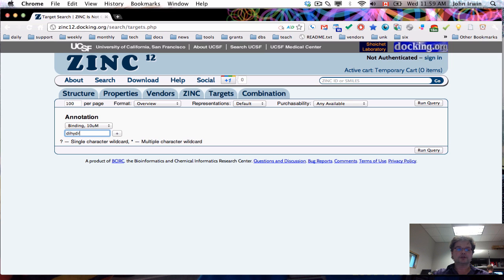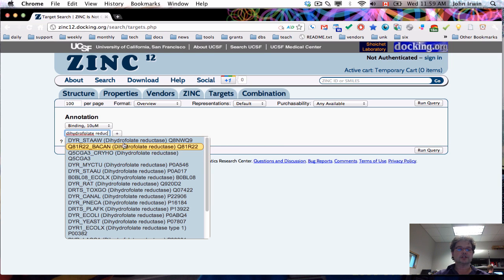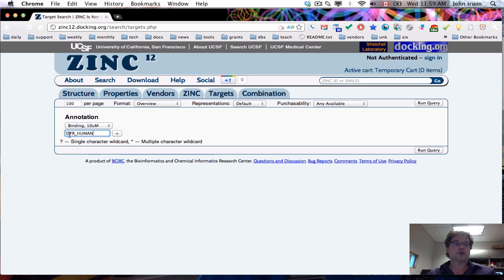So we're going to type in dihydrofolate reductase and you can start to see that they're from various microorganisms as well as E. coli, yeast and so on. The mammalian are down here at the bottom and we're going to pick dihydrofolate reductase human, which corresponds to a UniProt code of dyr underscore human.